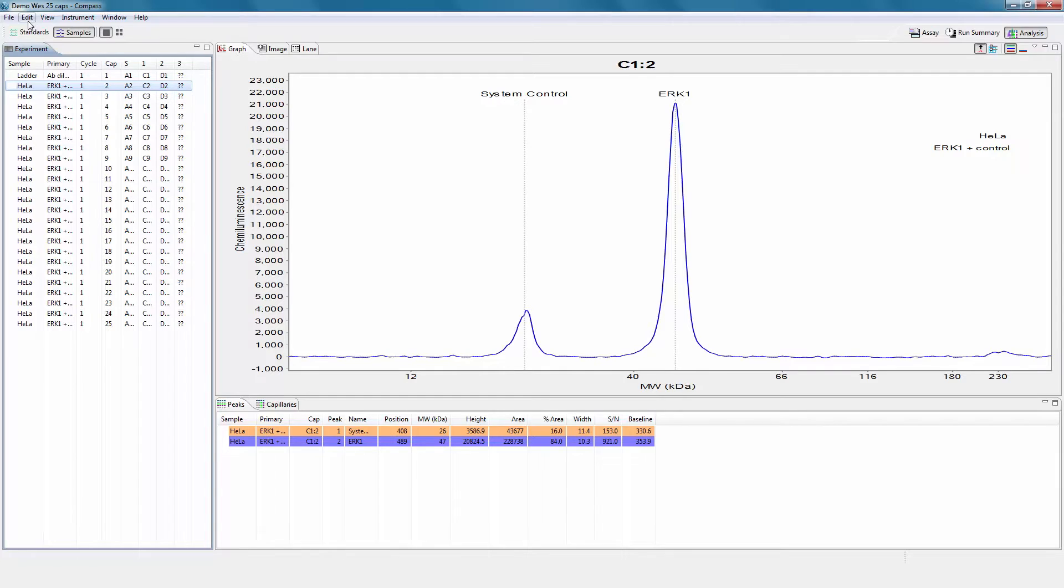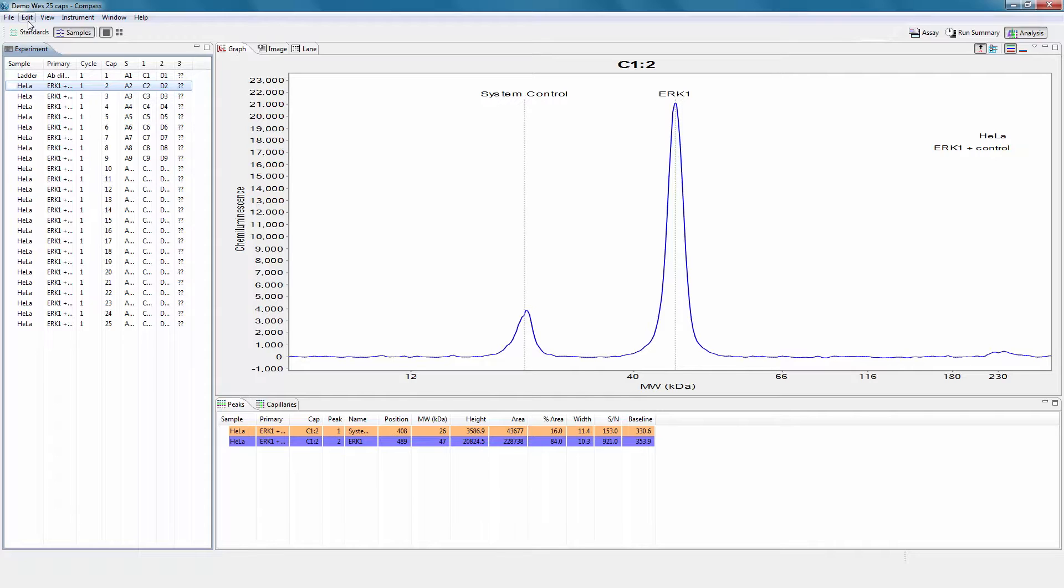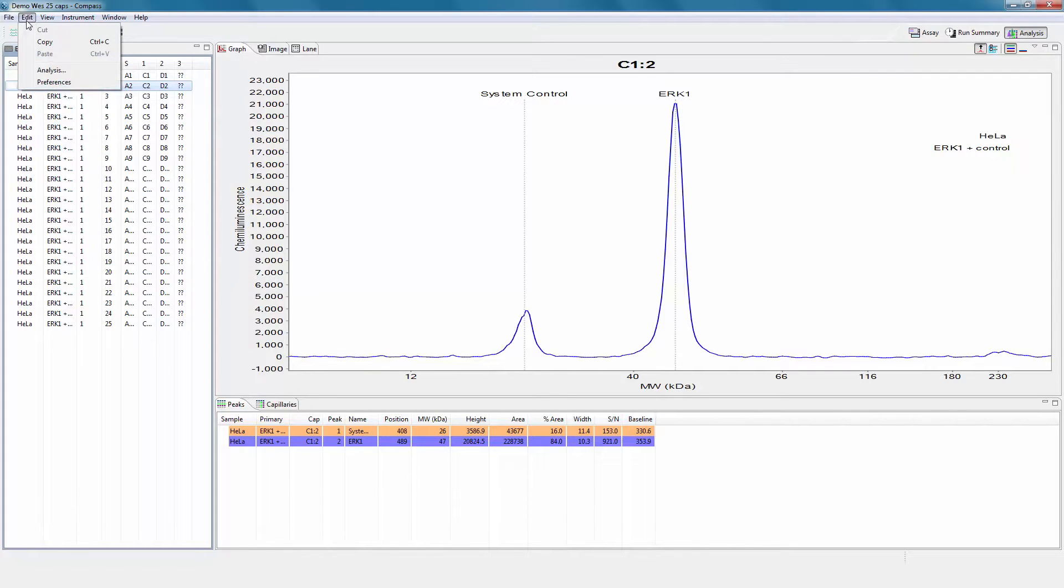Image exposure settings allows users to view what chemiluminescence exposures were taken during the run, and to view data for different exposures in the analysis screen. To access these settings, select Edit in the main menu and click Analysis.